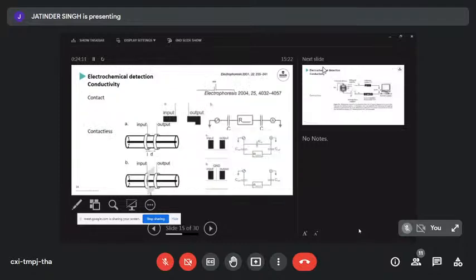Changing gears, we talked about conductivity detection before. Conductivity detection is not the most complex technique; it measures conductivity or differences in conductivity. So if your analyzed zone has a different conductivity to your background electrolyte, you get a different detector signal out. And this should have animated.